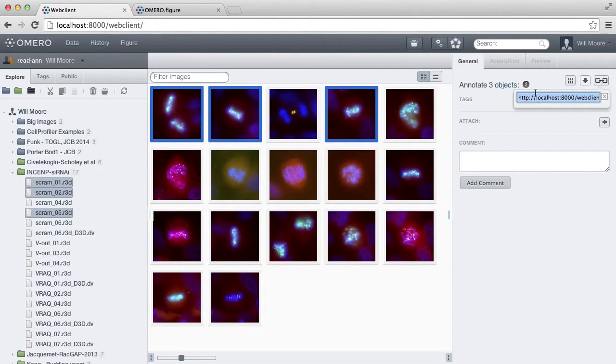This gives me a URL to these images, which also contains the image IDs, so that can be used as a reference to the images.